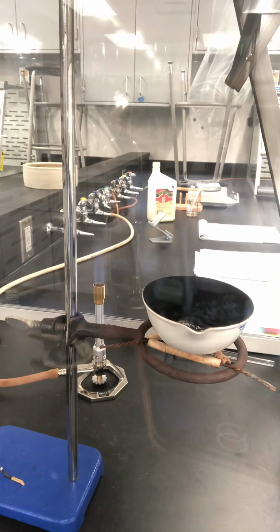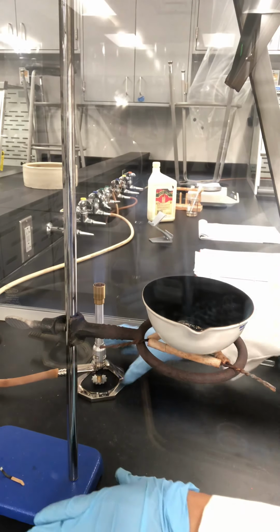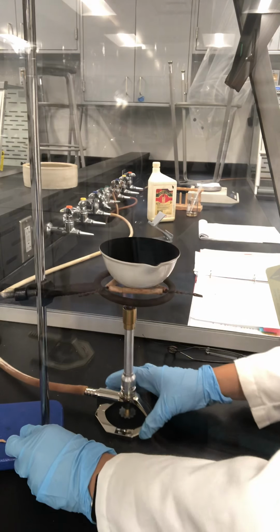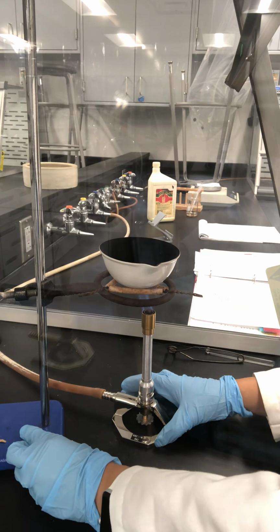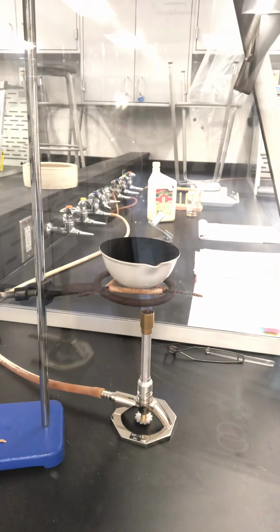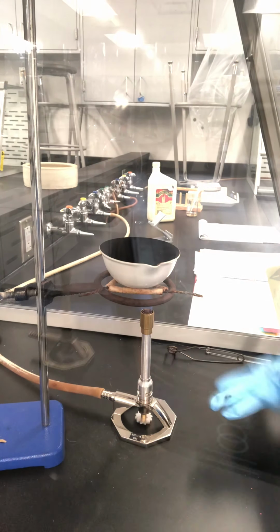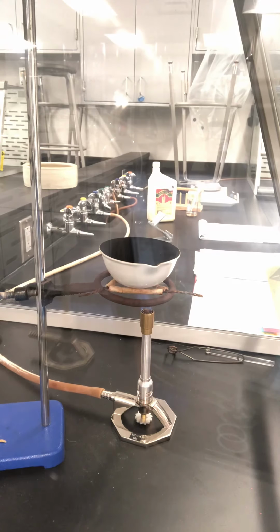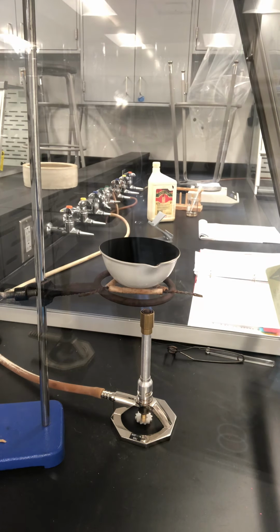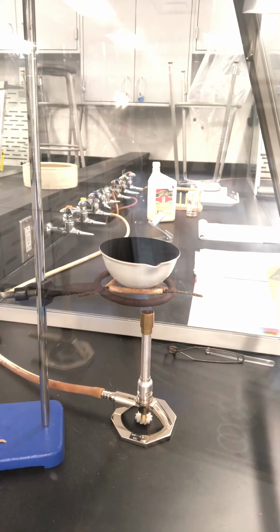Now we will carefully heat the evaporating dish until the white foam fumes are no longer produced. My question is, why do we need to add sulfuric acid? I'll give you some clue. What's the relationship between sulfur in the oil and the sulfuric acid?